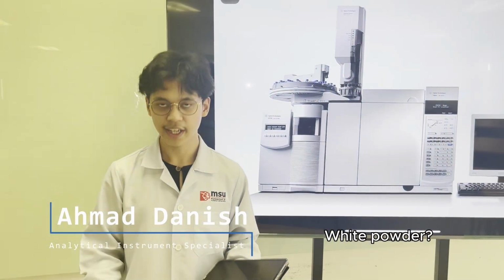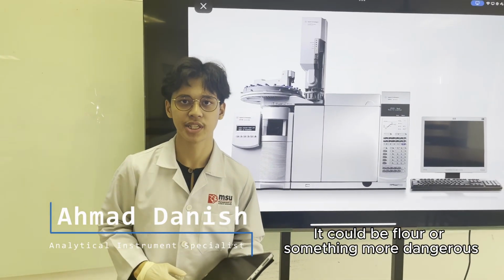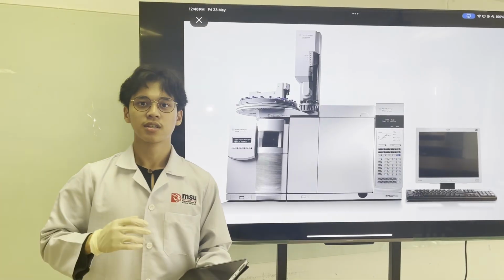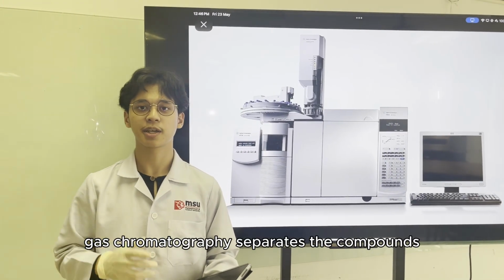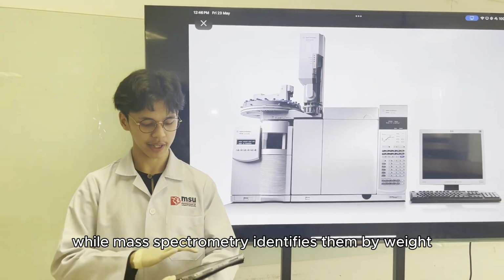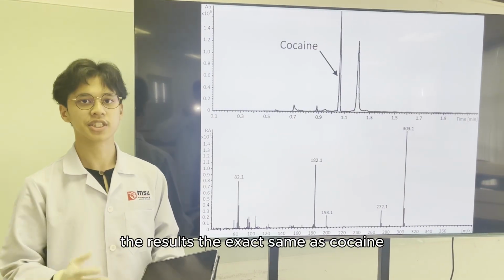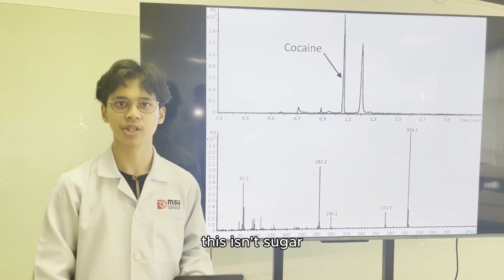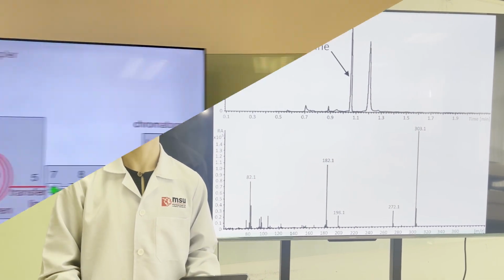White powder? It could be flour or something more dangerous. Let's run it through the GCMS. Gas chromatography separates the compounds, while mass spectrometry identifies them by weight. The results: the exact same as cocaine. This isn't sugar, this is a drug operation.